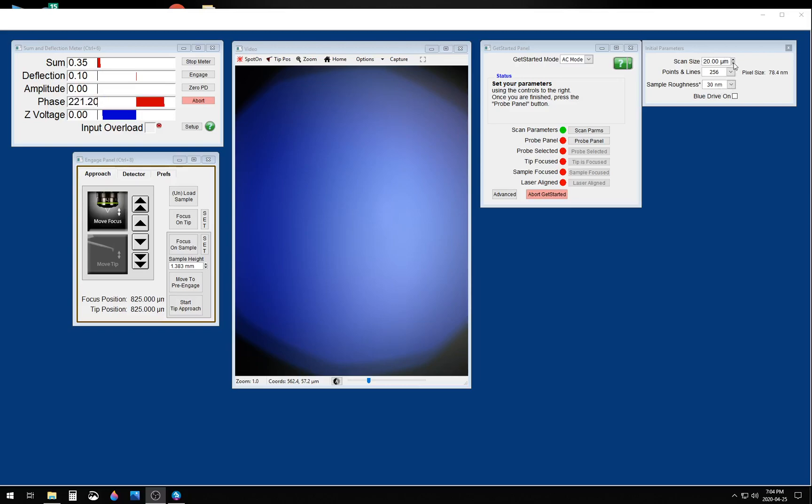So you first want to enter your scan parameters, such as scan size, pixel resolution, an estimate of your sample roughness, and whether you want to use Bluedrive.